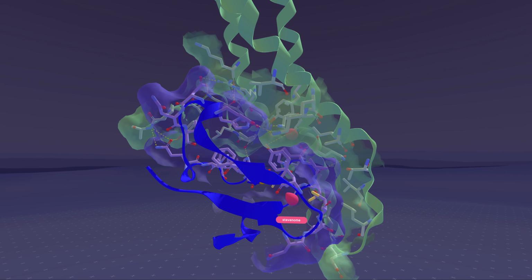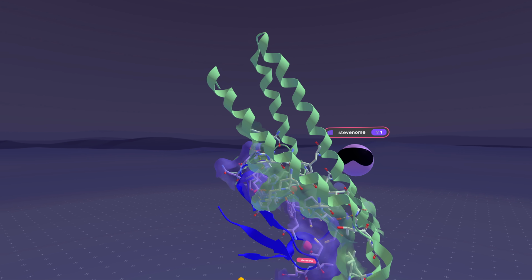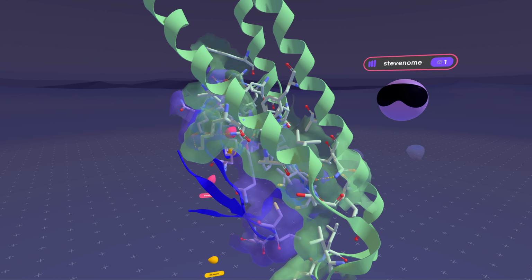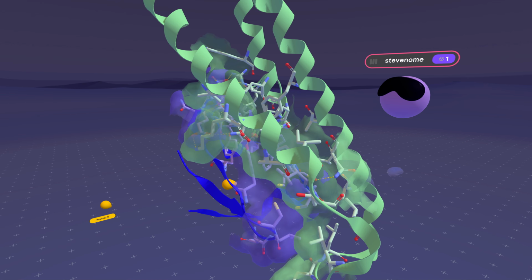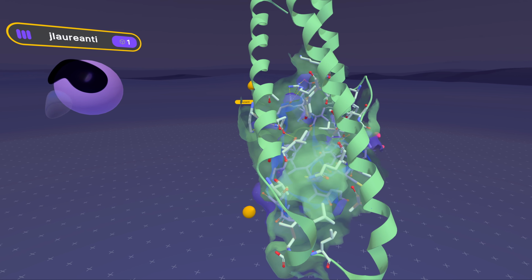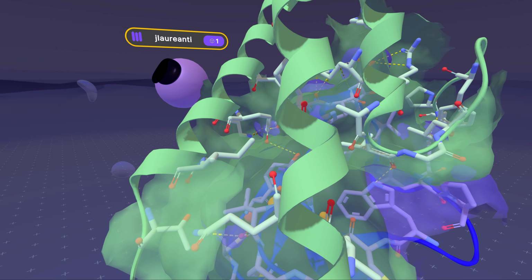So do you know if Labs is basically coming up with amino acid residue positions that would form hydrogen bonding and then building out the structure from there? Or we don't really know exactly how they're doing it. From their website, they have a cool little video of this happening, and it looks like they're building the interface first, and then they expand around there and make the actual protein backbone.